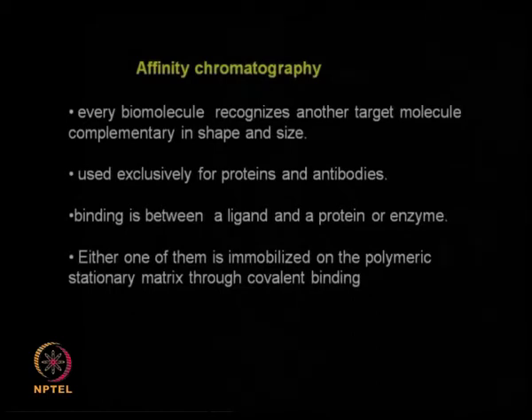So you have a protein, an antibody, a ligand, an enzyme and so on. Either the protein can be immobilized on the stationary phase or the ligand can be immobilized on the stationary phase. It tries to capture whatever is complementary to it, both with respect to shape and size.